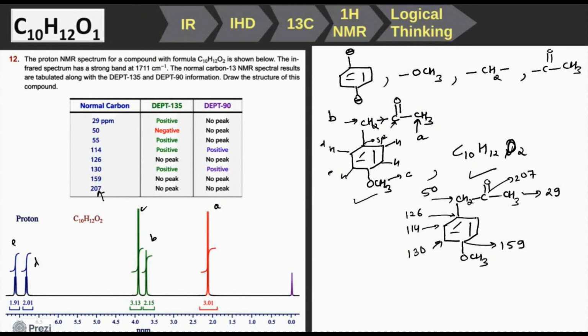Hence we can say that the correct structure for the given problem is 4-methoxyphenyl acetone. This is the name of this molecule.